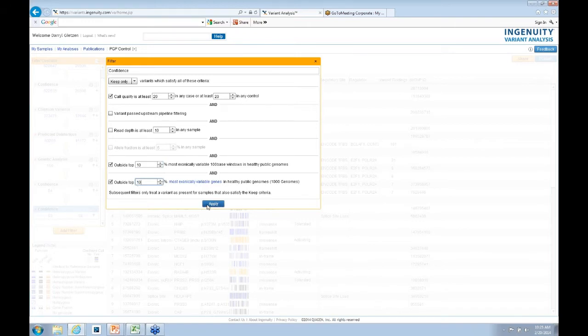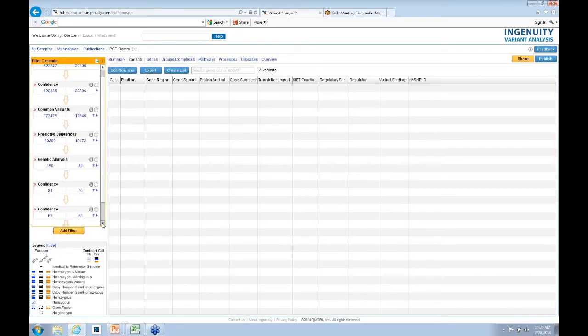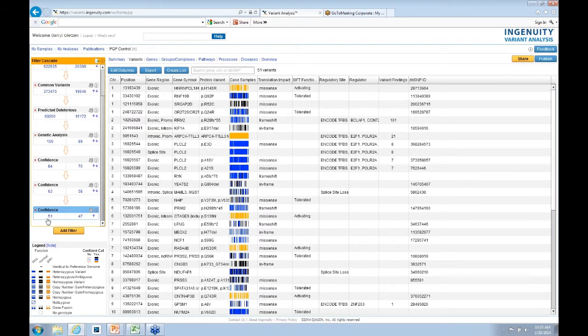Now, you're going to be throwing some gene content away, but when you have good variants hiding out amongst a bunch of artifacts, it's questionable whether you're going to be able to make sense of that. So you can see we're down to 51, so we really cranked this down. There's still a whole bunch of variation over here that's still pretty noisy, and you're probably wondering, okay, well, great, now what do I do? Here's a solution you can consider.